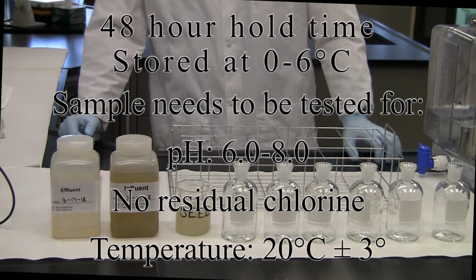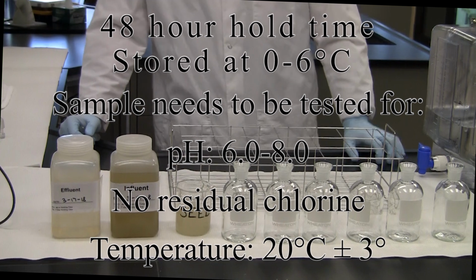Residual chlorine needs to be checked for presence. Use sodium sulfite to remove any present residual chlorine. Temperature needs to be close to room temperature before taking the initial dissolved oxygen measurements. Room temperature is 20 degrees Celsius plus or minus 3 degrees.